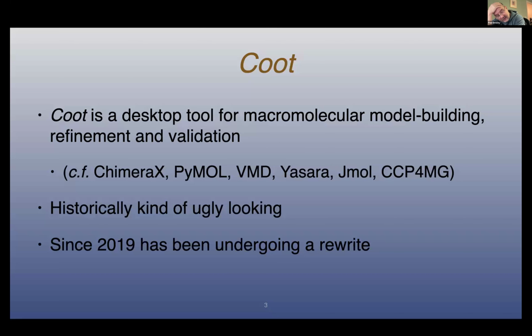Well, 2008 is when the Python developers said that Python 2 was going away, and consequently that meant a change in the toolkit was required. So it's been on the cards since 2008, and it started in about 2018, 2019, COVID times. That's when it really happened. There was a big rewrite to make it work with the new graphics and new GUI, and to separate the libraries so that they can be used with Python. More on that in a moment.